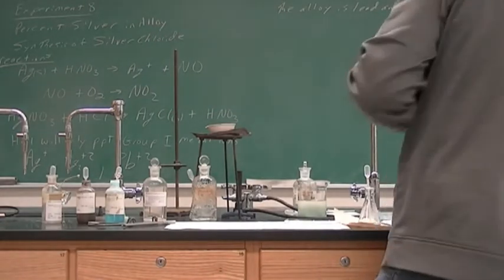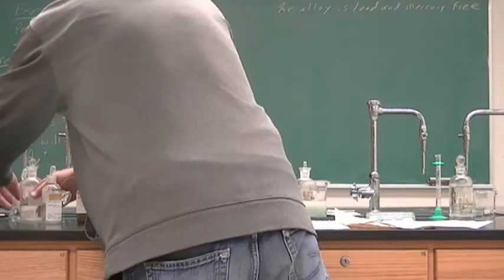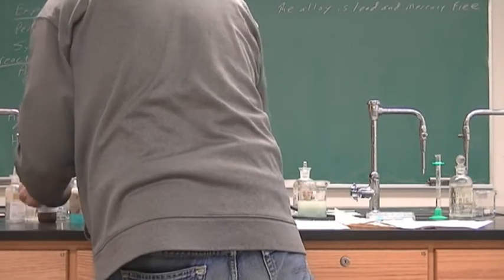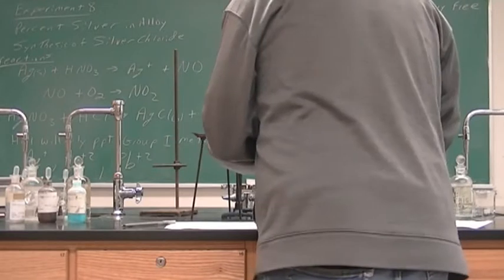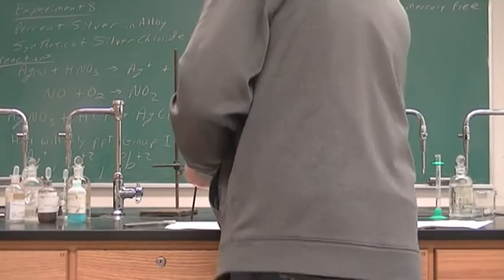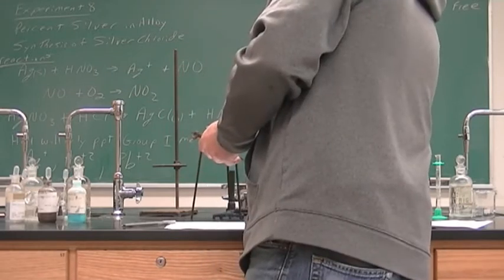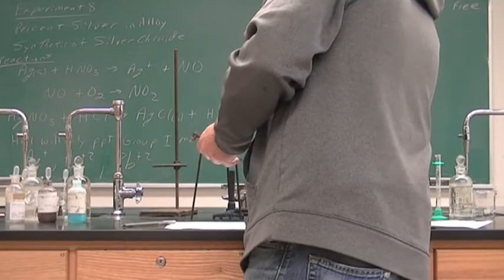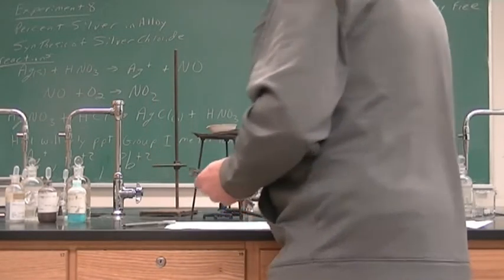All right, so we're going to use a Bunsen burner to heat this. All right, when you're adjusting the flame, you don't adjust it down here.